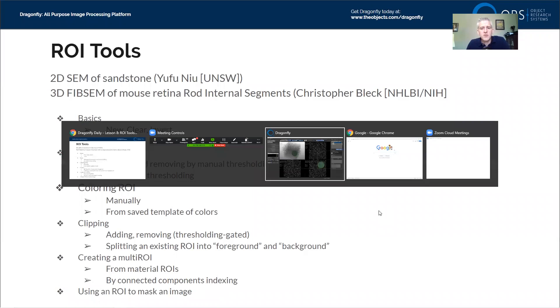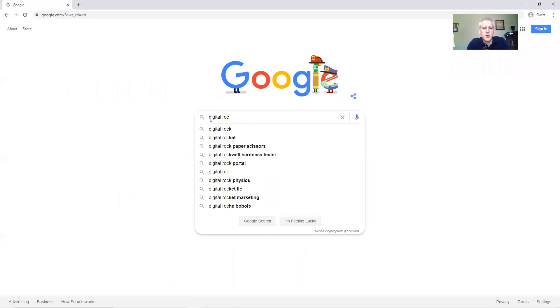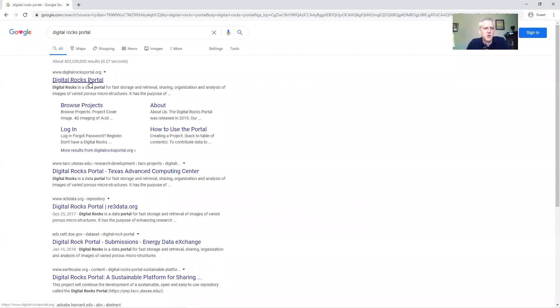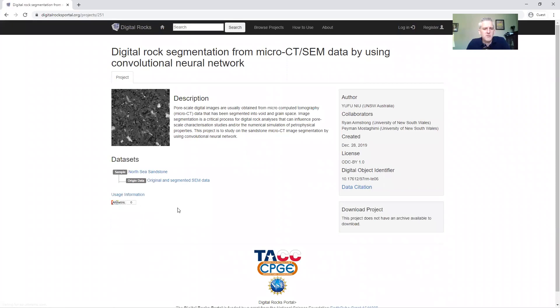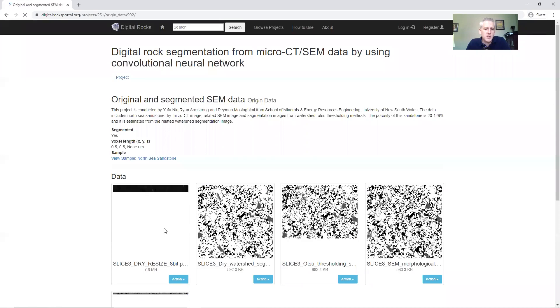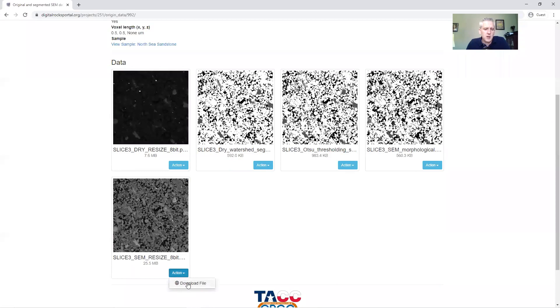You can go to the Digital Rocks Portal where we'll find Yufu's SEM image. Go to Browse Projects, scroll down to 'Digital Rock Segmentation from Yufu.' Click View Project — there is a microCT and an SEM of this North Sea Sandstone. Click on Original and Segmented to grab the image — it's a 25 megabyte SEM image that you can download, and that's what we're using today.